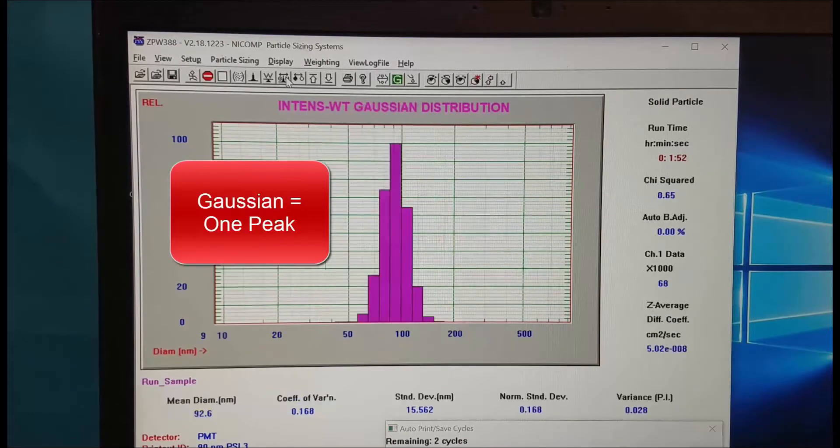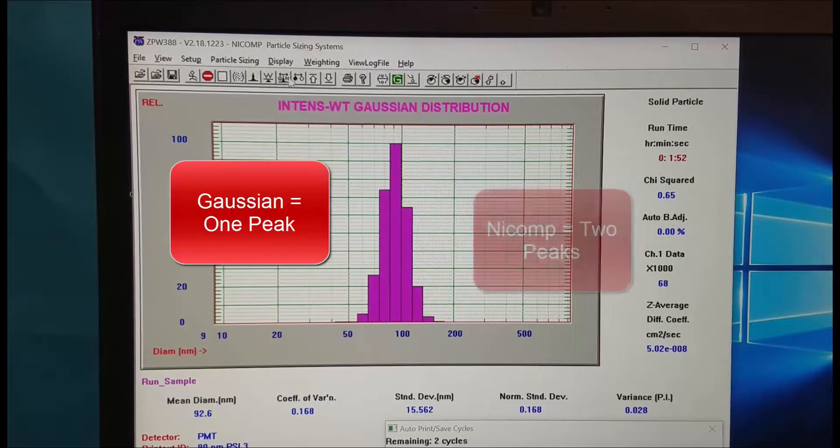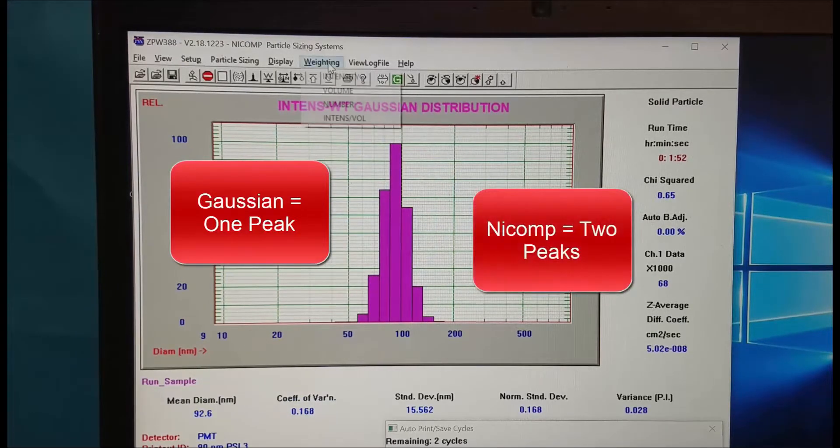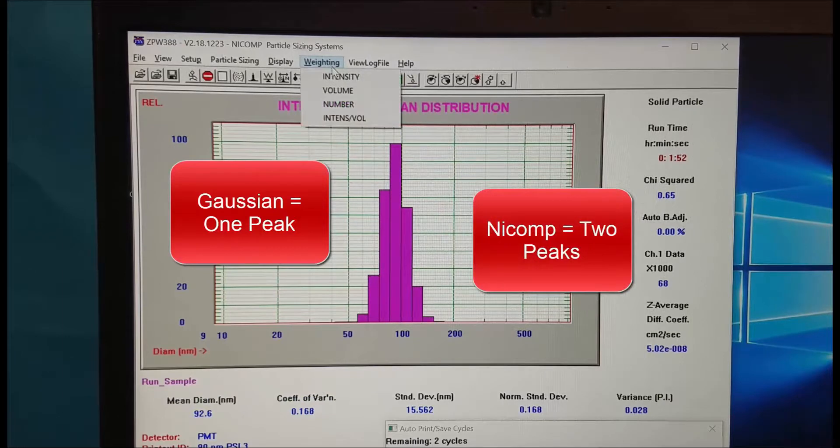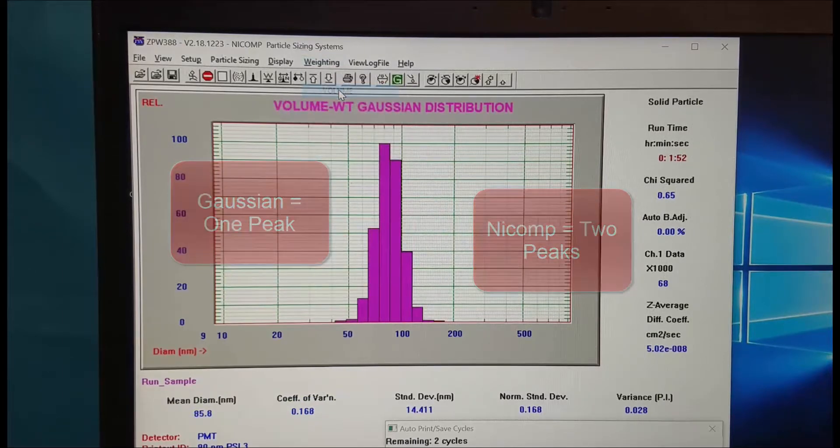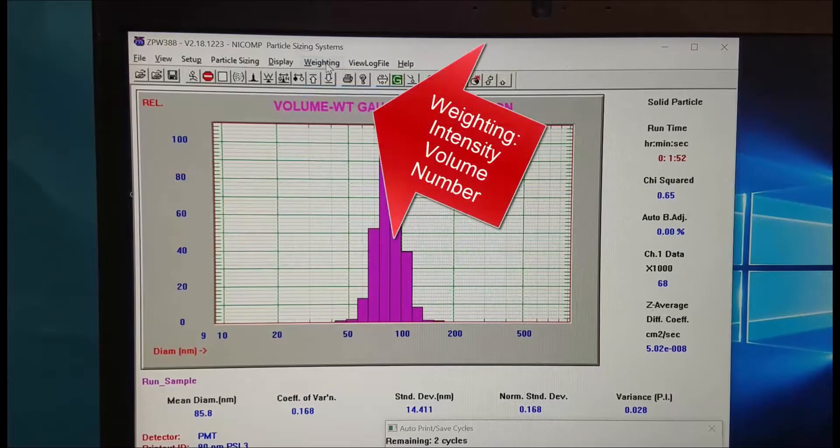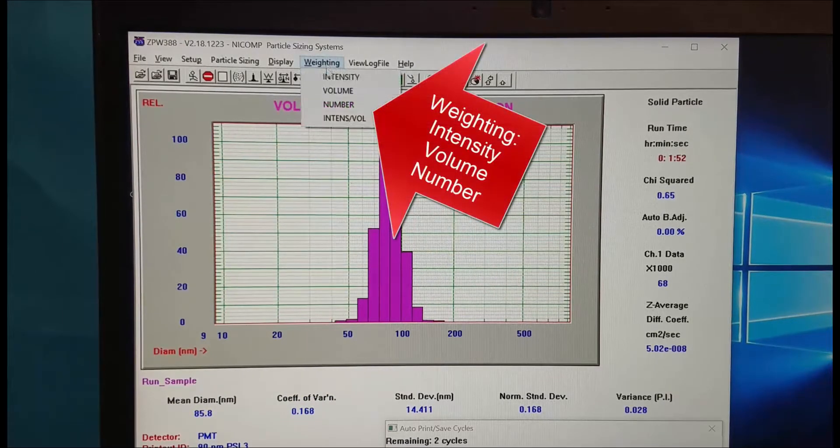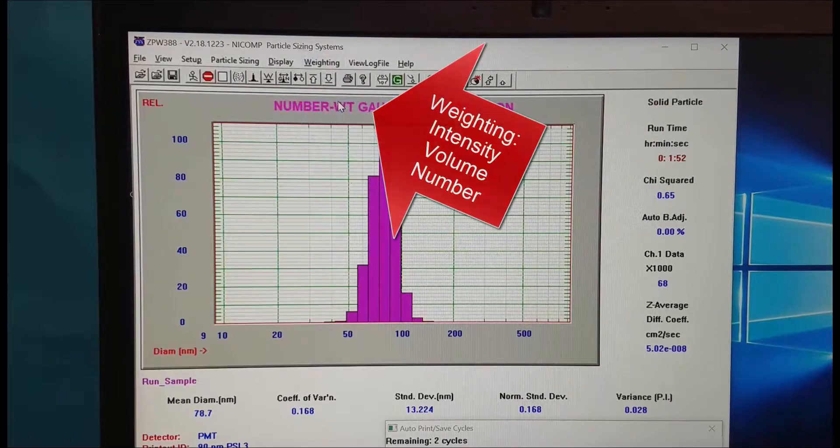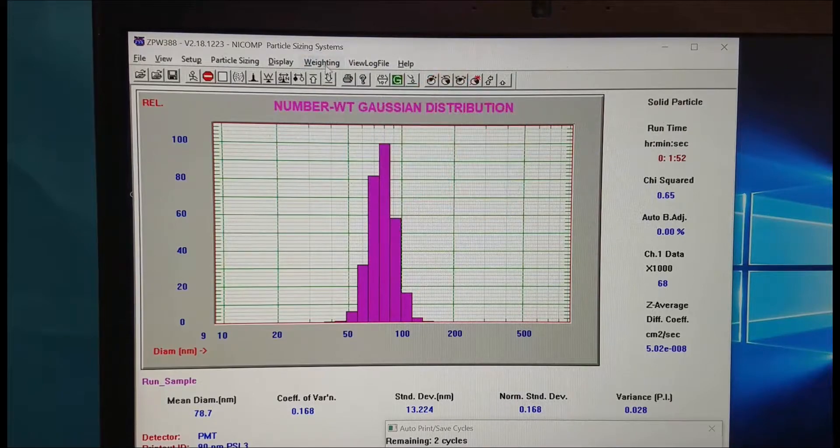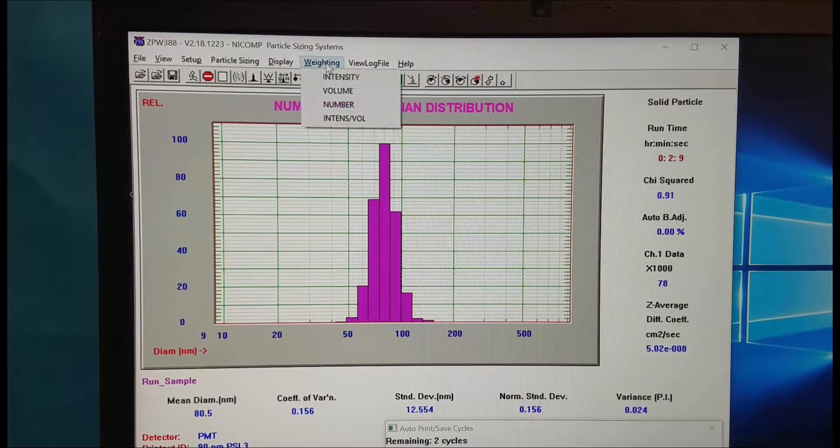Click on this G and N button to switch between the Gaussian and the Nicomp distribution. Weighting allows us to look at the intensity, volume, or number distribution.